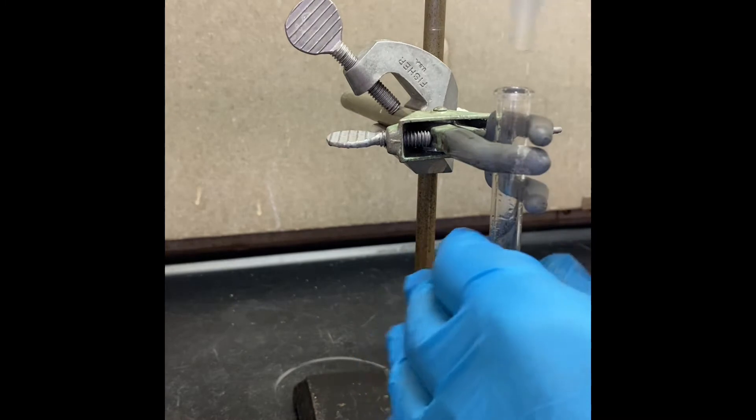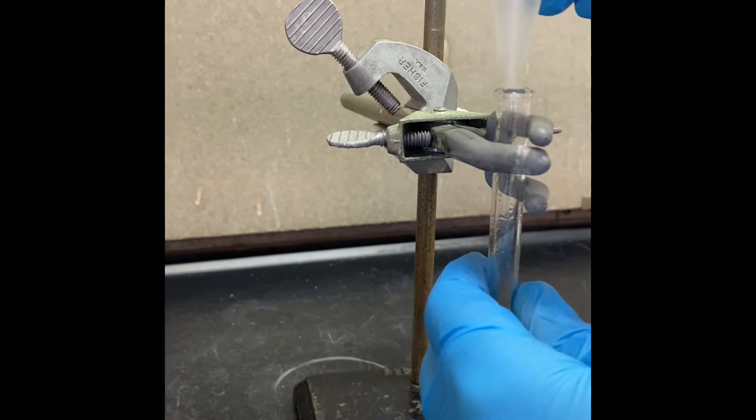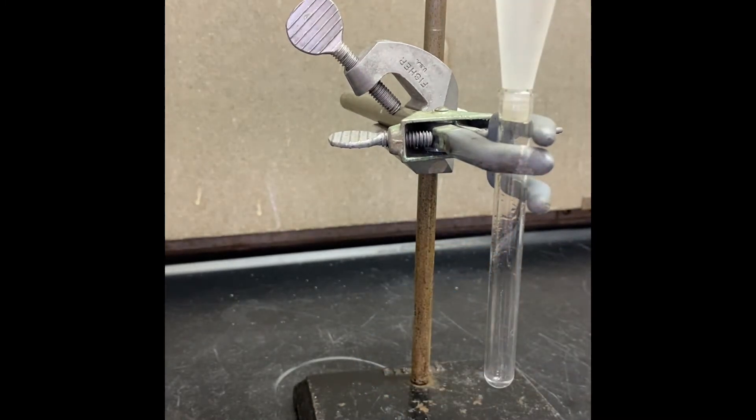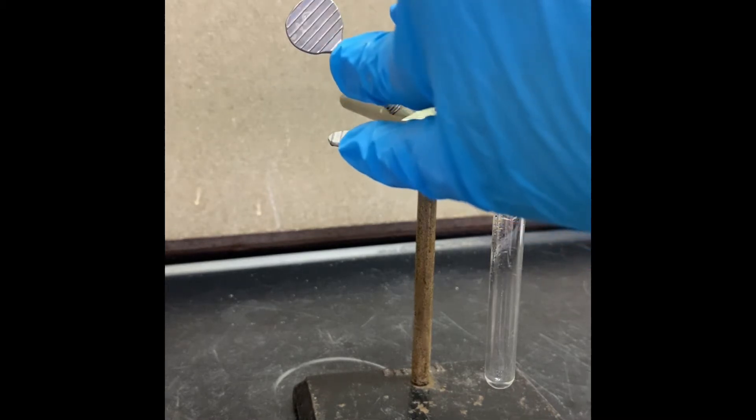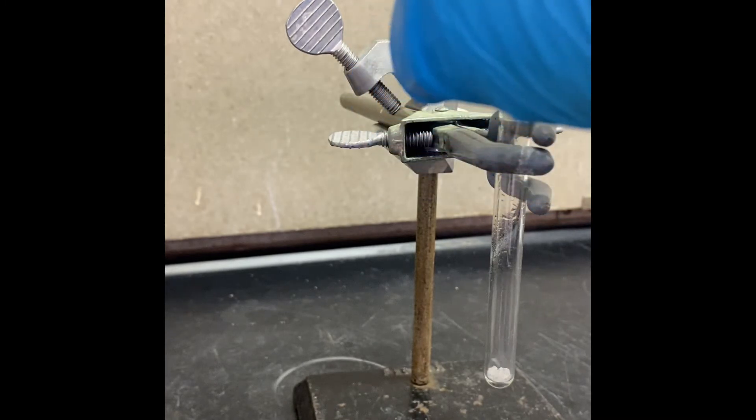1,4-dimethoxybenzene is a solid so I am going to use that funnel for that. I am going to get 120 milligrams of 1,4-dimethoxybenzene and now I am transferring that to my reaction flask.